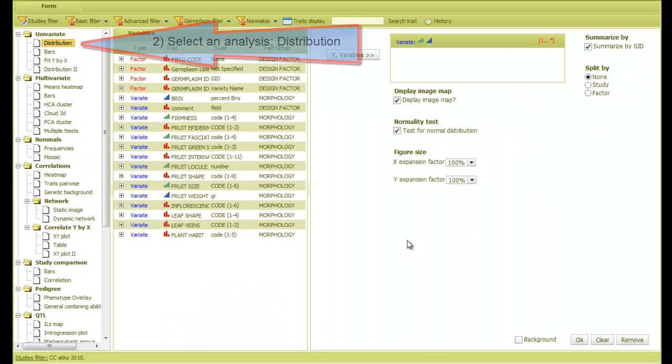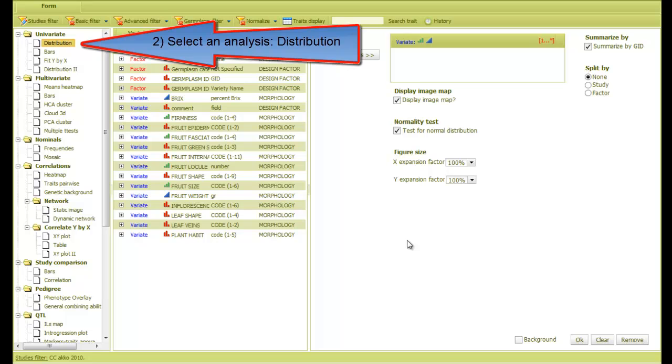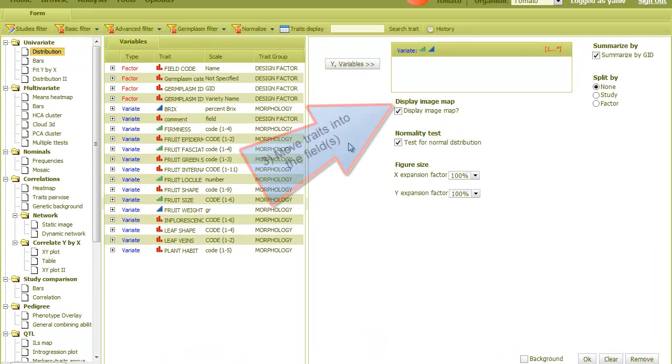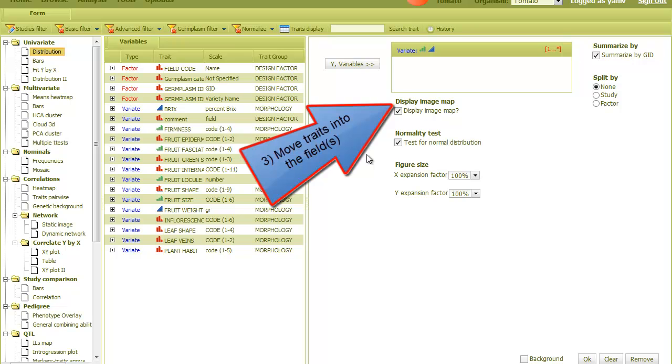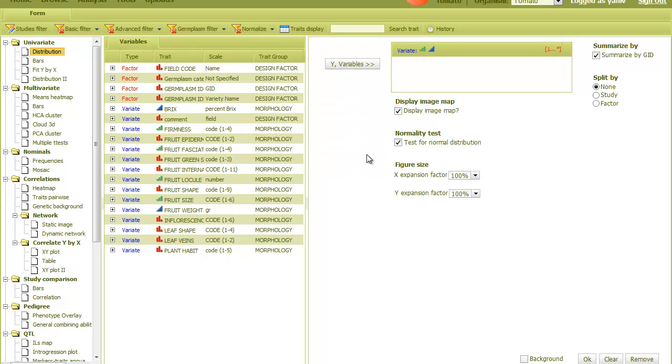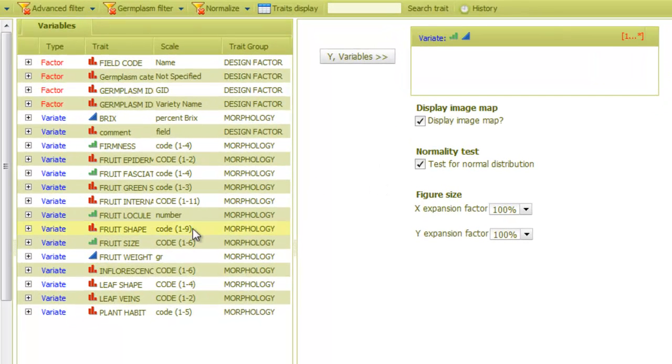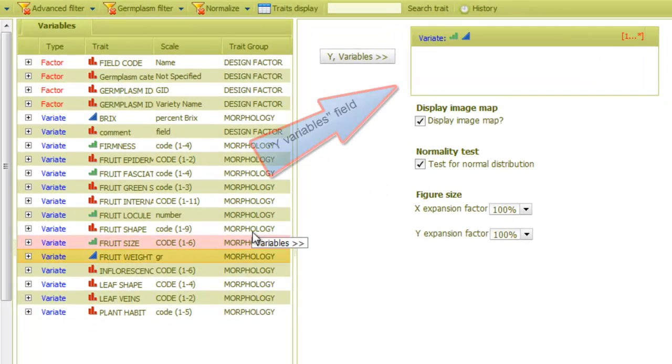The second step is choosing the analysis we want to perform from the left. Here, I'll start with the first analysis, which is distribution. The third step is to move traits from the list to the appropriate fields in the form. Here, for example, I'll take the trait fruit weight and drag it into the Y variables field.